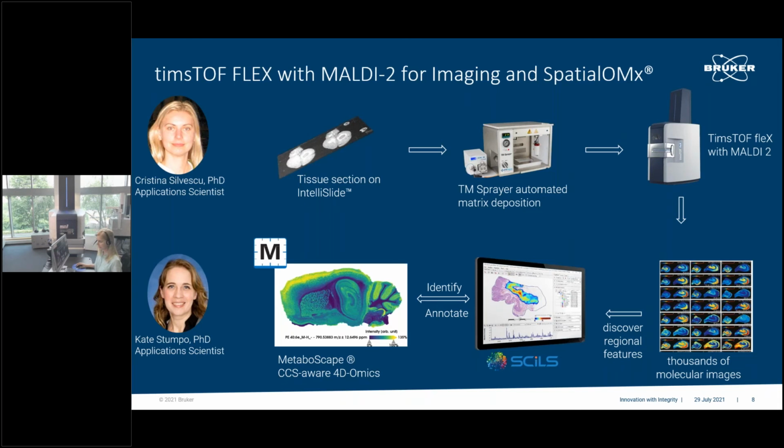We use specific glass slides which are conductive, and you can see here in my hand, I'm pointing to the camera, our glass slides. I'm also going to show them in the image later on.